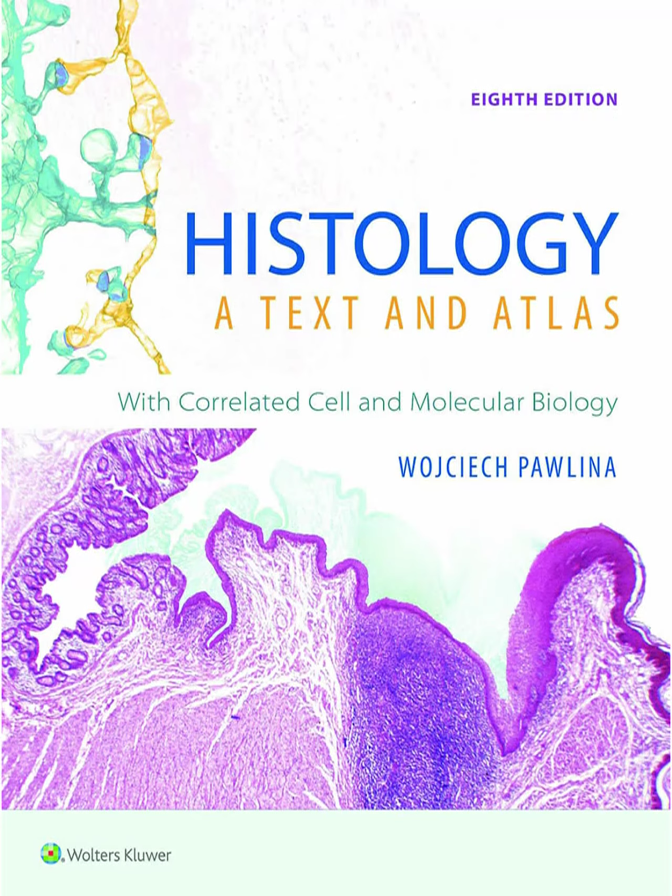Frozen? How does that work? Well, the tissue is rapidly frozen, say in liquid nitrogen or cold isopentane, very quickly. And then it's sliced while still frozen in a special refrigerated microtome called a cryostat. Okay, a cold slicer. Yep. And these frozen sections can then be stained with specific dyes that actually dissolve in fats, making them visible.